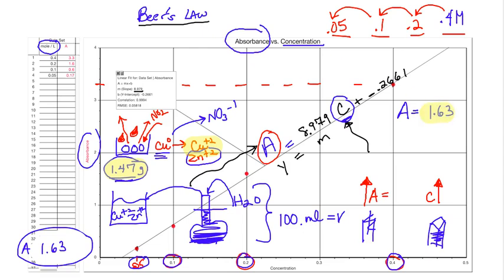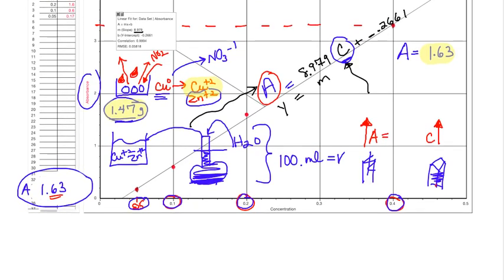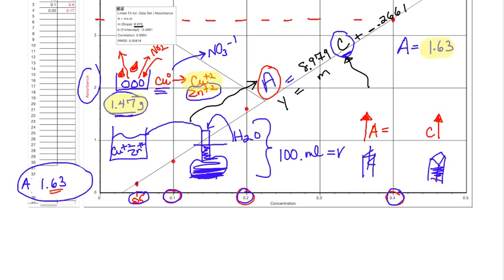Now, by the computer reading that absorbance of the cuvette filled with the ions that were oxidized from the nitric acid, now we can solve for C. Now, how would we do that? Again, let's rewrite this and make this very neat. From the linear equation, from calibrating, A, absorbance, is equal to 8.979 times concentration minus 0.2661.